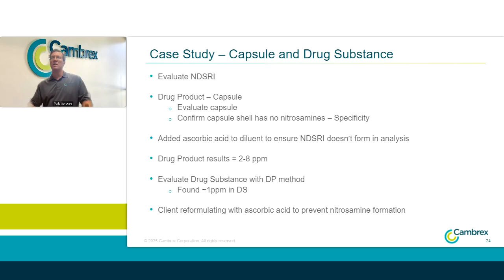The NDSRI seemed to be very readily reactive, and so we did add ascorbic acid to the diluent to ensure that we were not forming the NDSRI during our analysis. Again, we do confirm that with any sort of sample preparation in terms of looking at that.